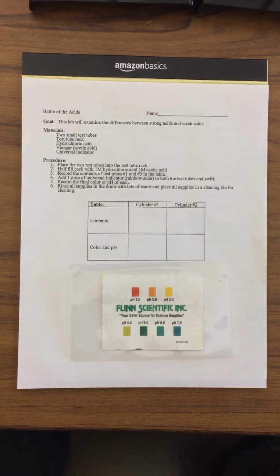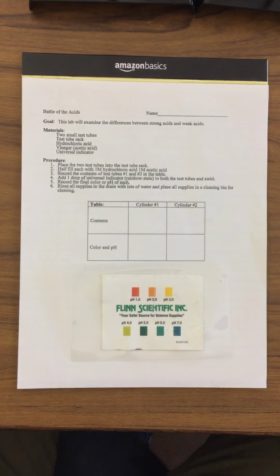This is the continuation, or part 2, of the battle of the acids. So let's go ahead and take a look at the contents of what we have. In the first cylinder, we had what was called hydrochloric acid, HCl. And in the second one, we had vinegar. We'll get to the chemical formula of vinegar in just a minute because we're going to be turning these over, and I want you to record your information on that. Or you might be able to actually record it in the small space down below here.